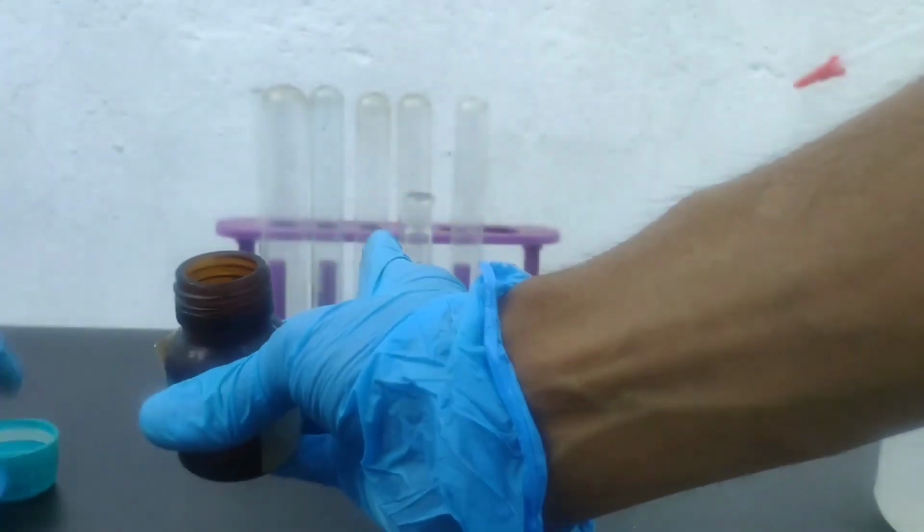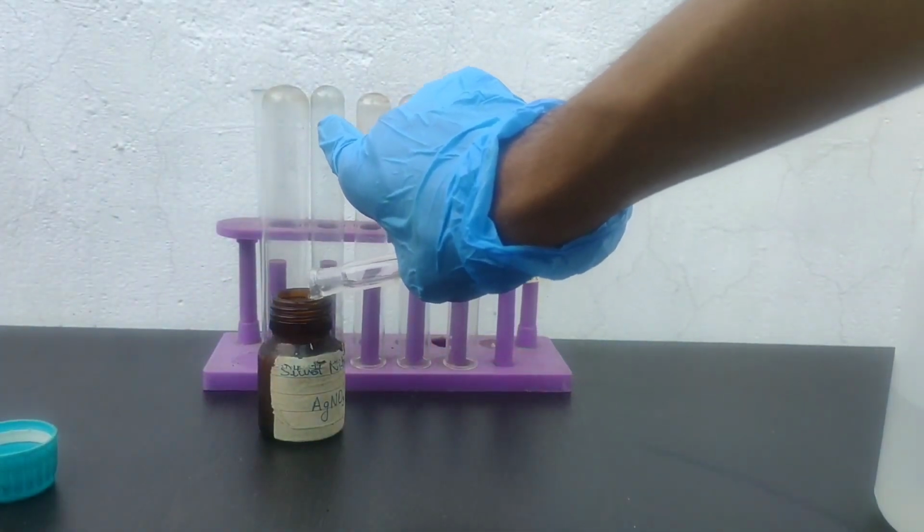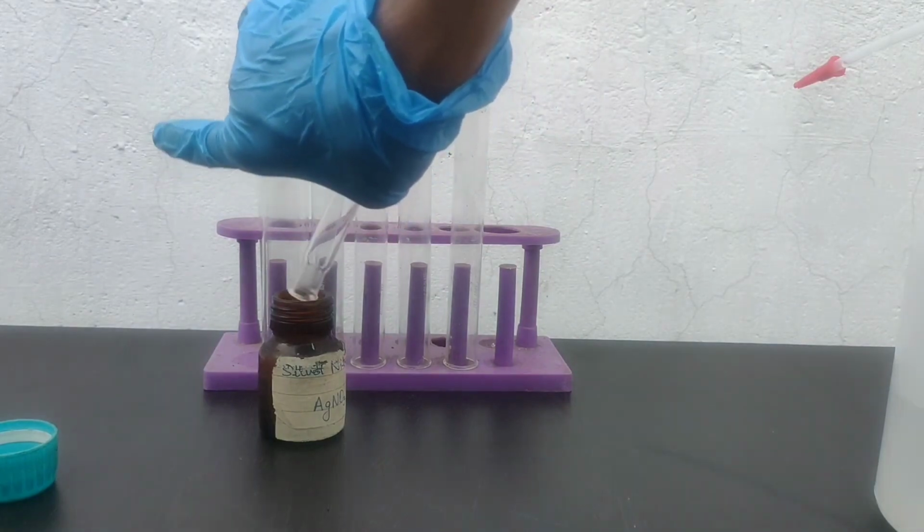The solution was then transferred into a dark colored amber bottle. This silver nitrate solution can be used to prepare standard solutions.